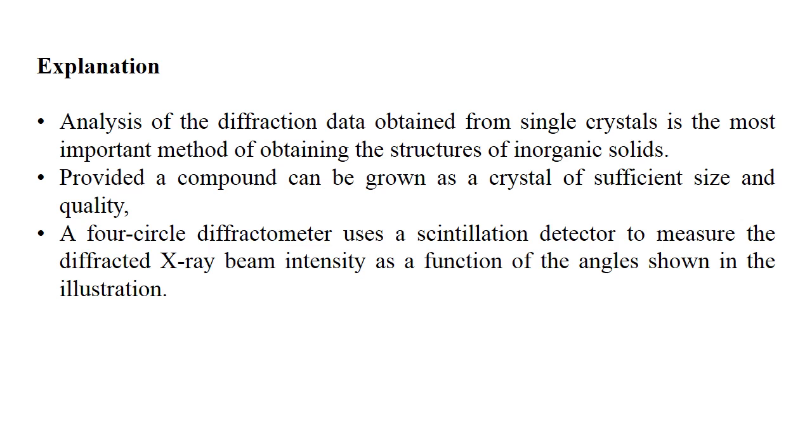It means when X-rays hit a single crystal and are diffracted, those diffracted beams, when detected by a detector, give a diffraction pattern or diffraction data that should be analyzed.